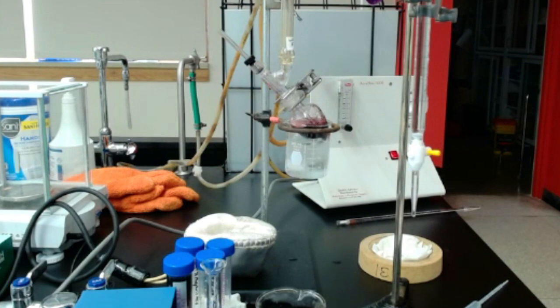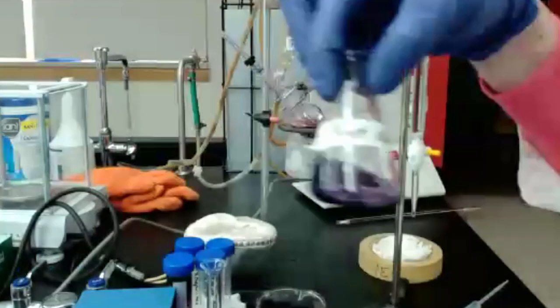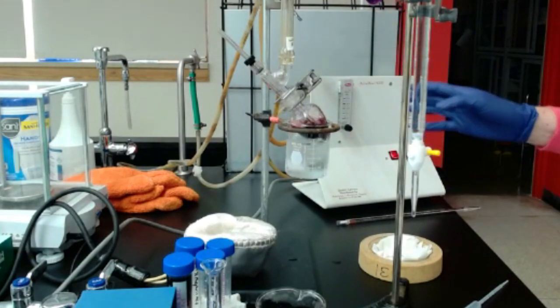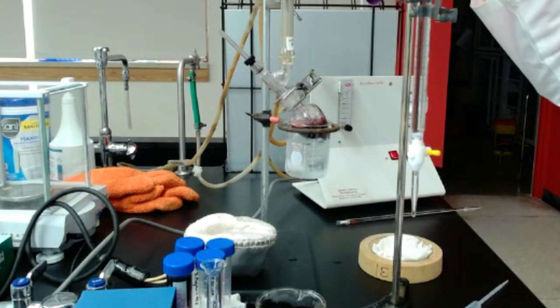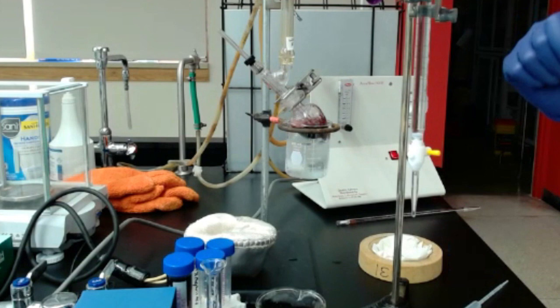So in this wine, I have 6.8 ppm, or milligram per liter, of total SO2. I can do the same on the Pinot Noir that we had also, because the free SO2 is still running, so you still have time to do other things. So let's start again. Now I have 18.1, nothing changed, but that's also good to check that the volume is still the same. So 18.1 is my initial volume.